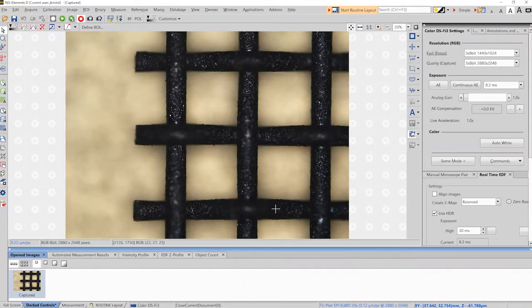Live Compare. The Live Compare module is just that, a module to compare a live image to a captured image, usually of the same component and same magnification. This is a very helpful operation in quality control and manufacturing.